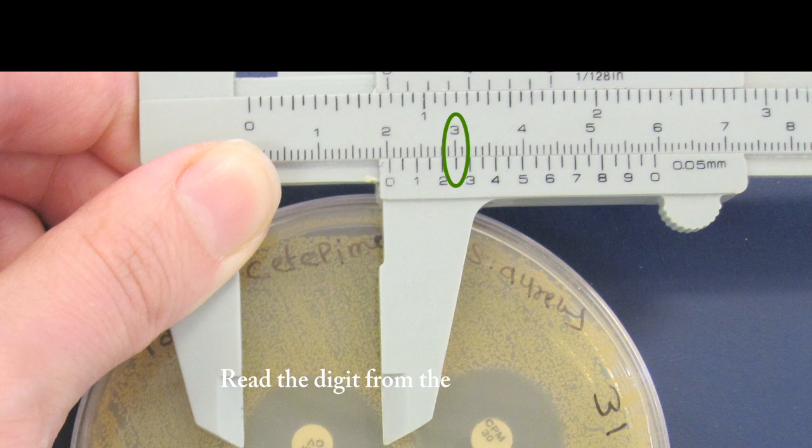Read the digit from the vernier scale. The closest reading here is 2.5.